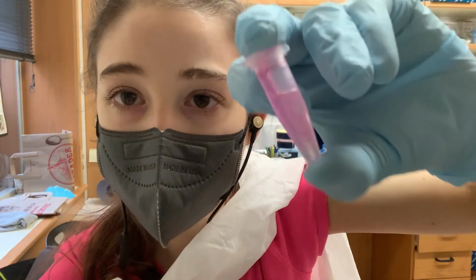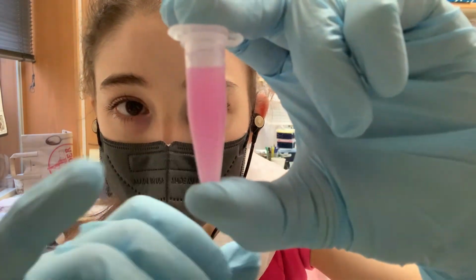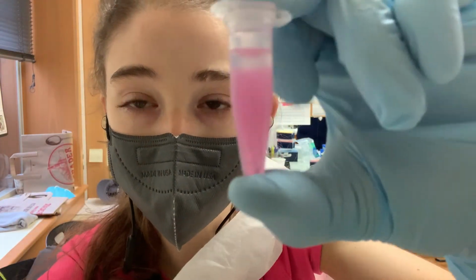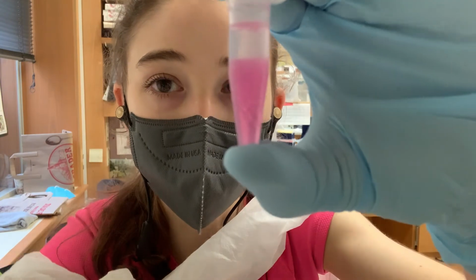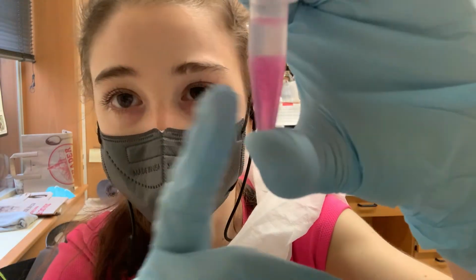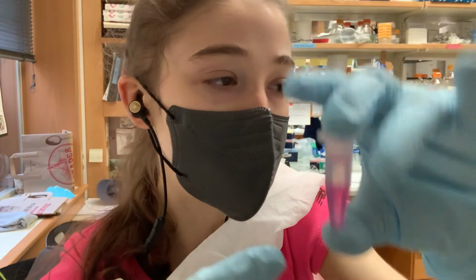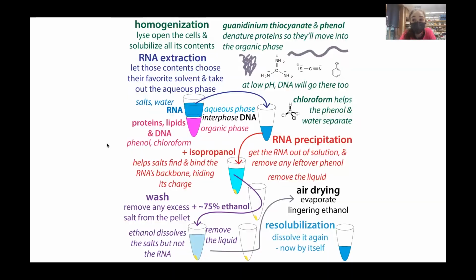But when you invert the tube and mix it all up, you're giving the molecules a choice. They're going to prefer one of the liquids over the other, and so then they'll separate based on that. And then we'll get really good separation when we centrifuge it, so we spin it down. So that's the basic idea. And now let's go into a little more detail. I'll start with an overview of where we're going, and then I'll go into more detail on the various steps.